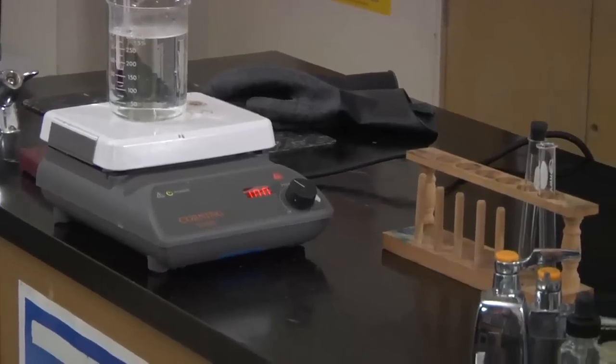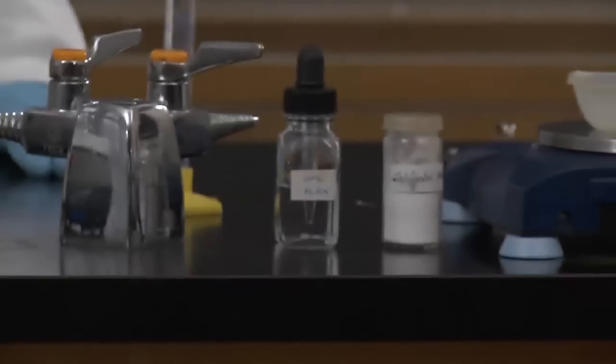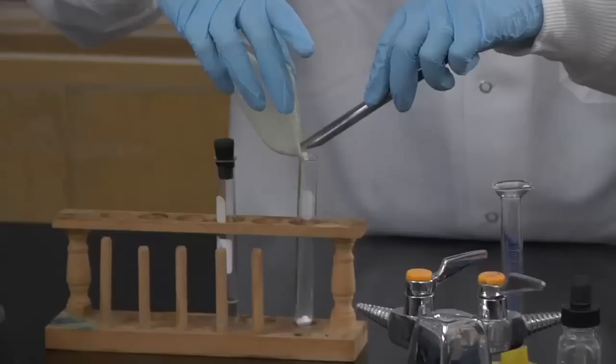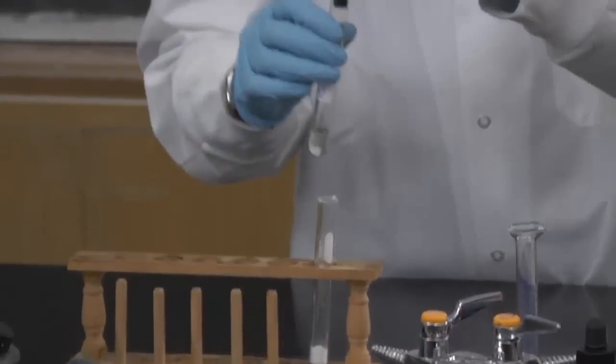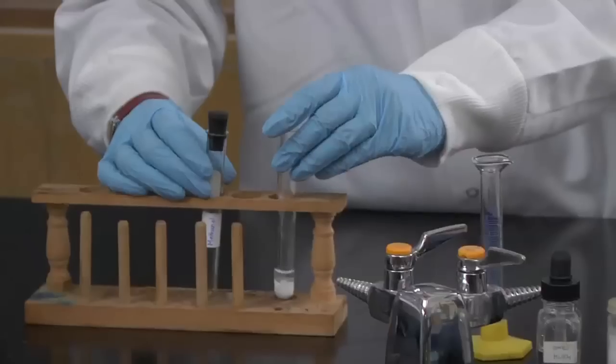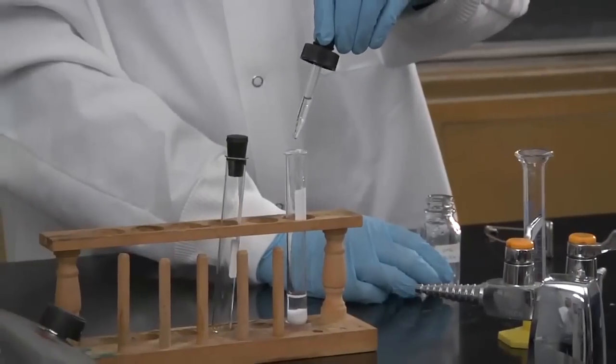To mitigate the risks of working with concentrated solutions, the volumes used in ester synthesis labs must be kept to a minimum: 1 gram of salicylic acid, 1 milliliter of methanol, and 3 drops of sulfuric acid.